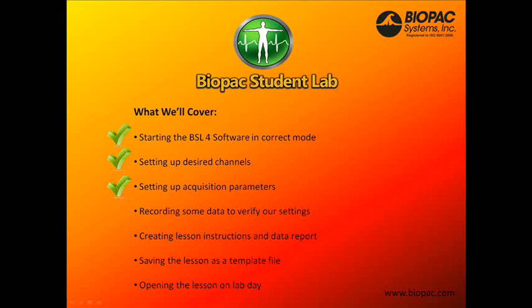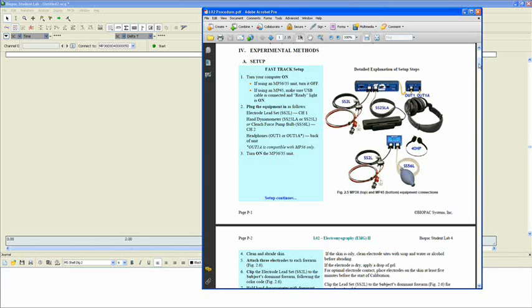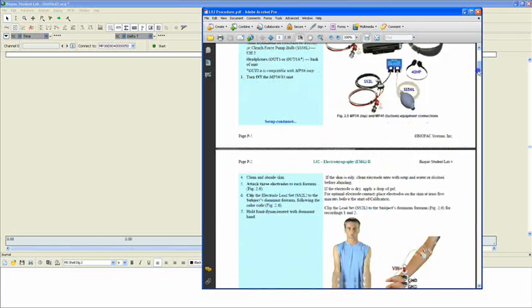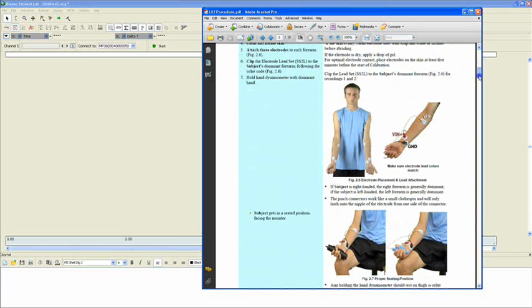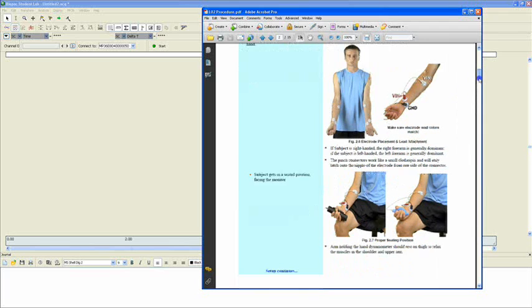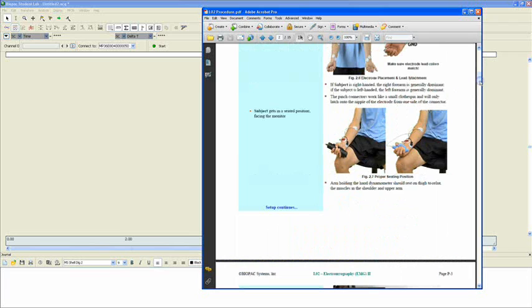Now that we've set up our acquisition parameters, let's record some data to verify our settings. Our system is set up similar to this picture here from the Lesson 2 procedure. We have the SS2L for our EMG plugged into channel 1, and an SS25LA hand dynamometer plugged into channel 2. We're going to set up our electrodes similar to this, with our red lead, black lead, and white lead connected to the subject as shown. Then, we'll have our subject grip the hand dynamometer and record a few clenches to verify our settings. Let's do that now.